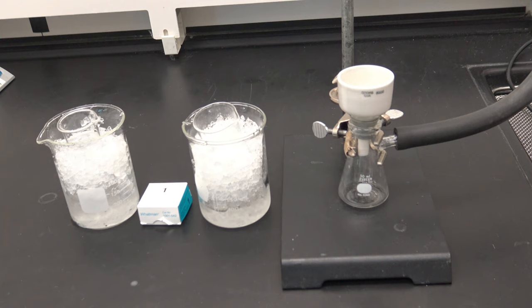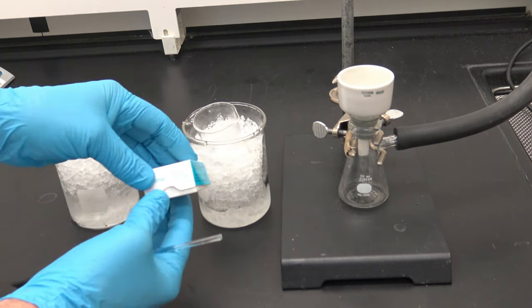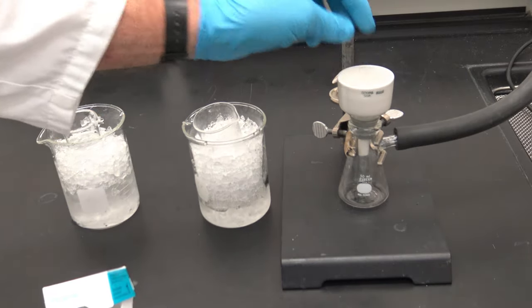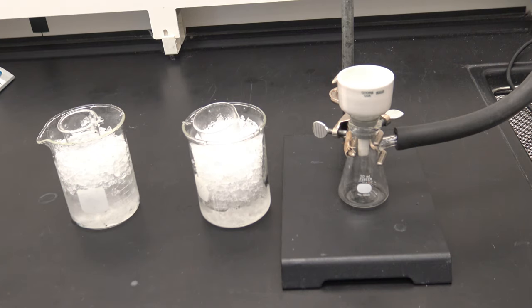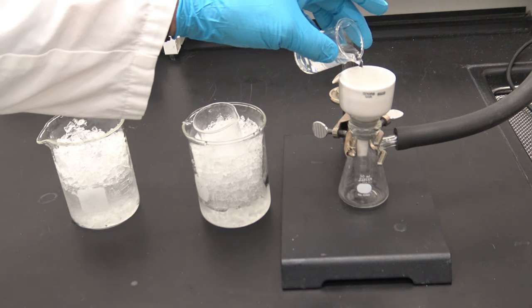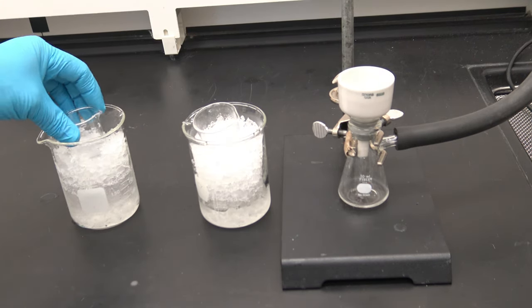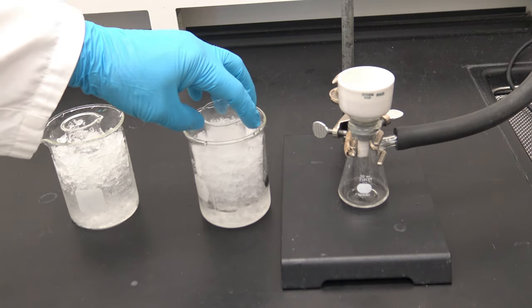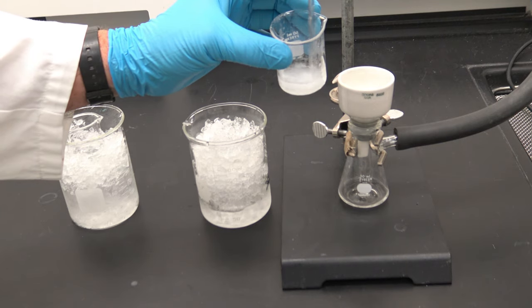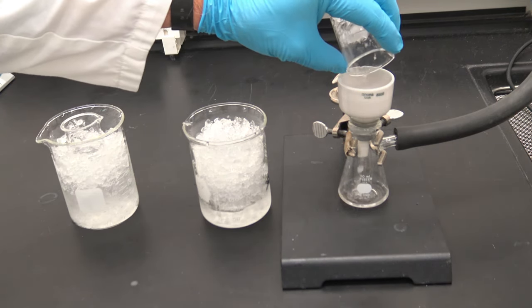We've had our beaker now in the ice bath for approximately 5 minutes. We're now going to do vacuum filtration again. I'm going to take a piece of filter paper, put it in my Buchner funnel, as we've done several times before. I'm going to turn on the vacuum. I'm going to pour a little ice water on top of that filter paper to seal it against the bottom surface. I'm then going to take my salicylic acid that's been recrystallized, stir it up a little bit and pour it down on top of there.